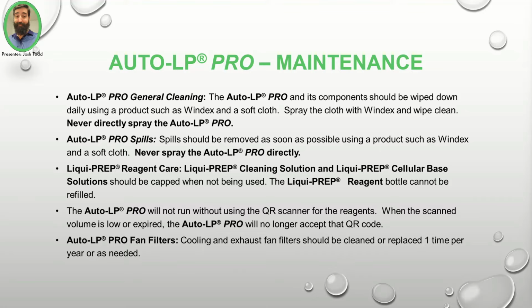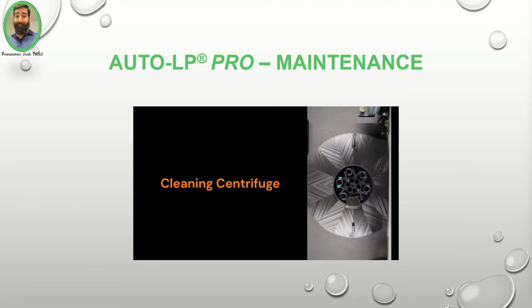AutoLP Pro fan filters, cooling, and exhaust fan filters should be cleaned or replaced once per year. We're now going to watch a quick video on cleaning the centrifuge in the AutoLP Pro.